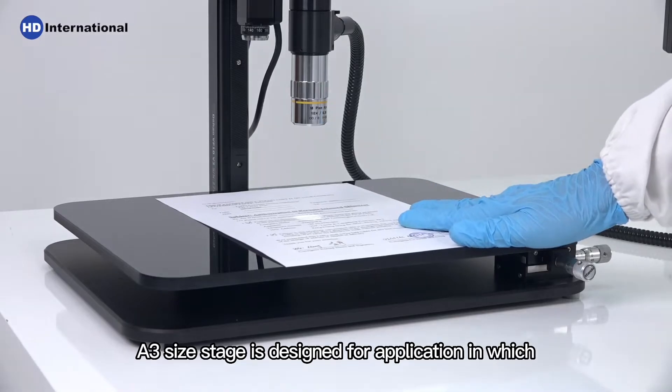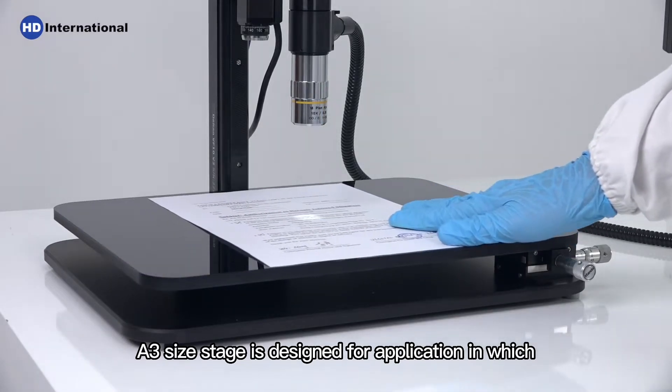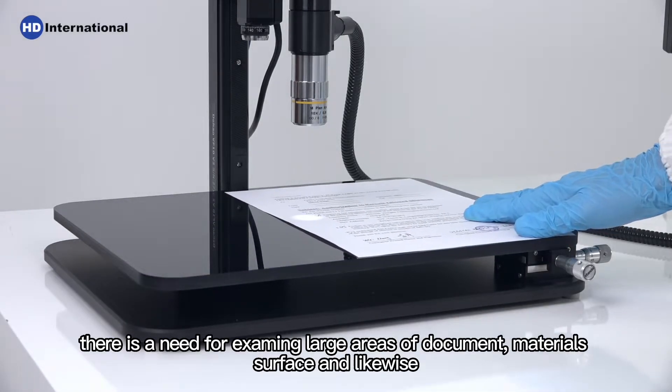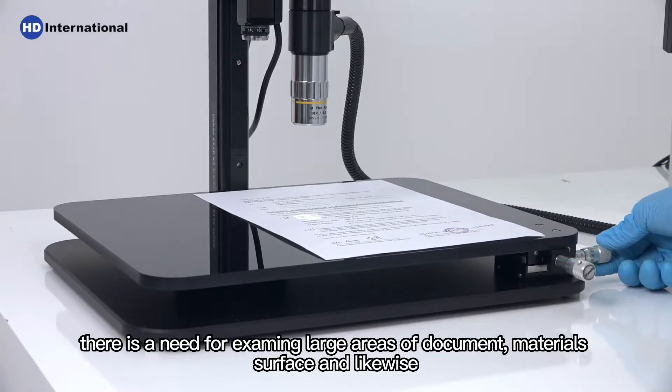An A3 size stage is designed for applications which require examining large areas of documents, material surfaces, and likewise.